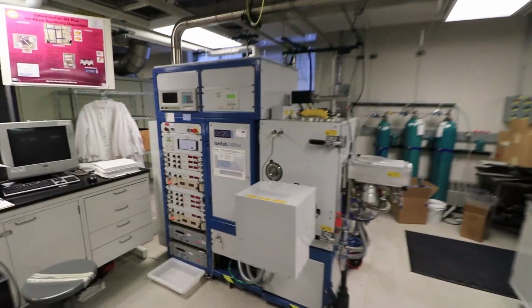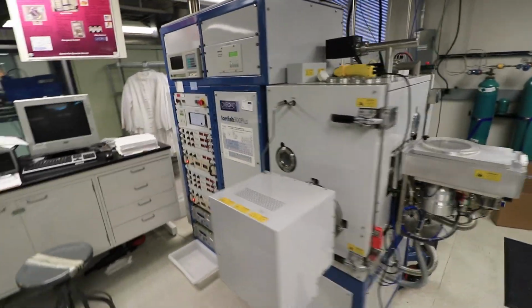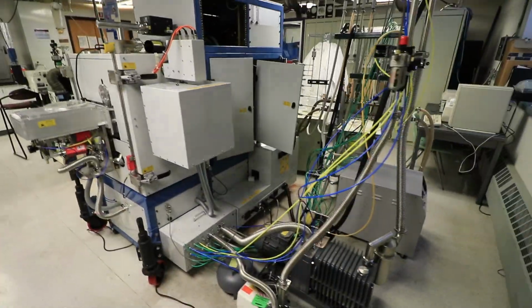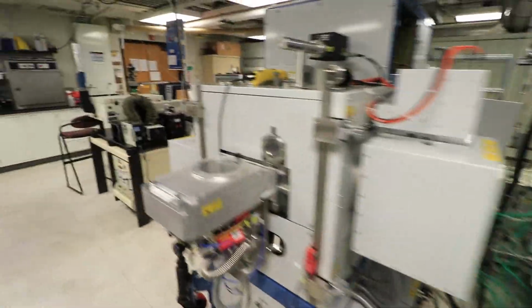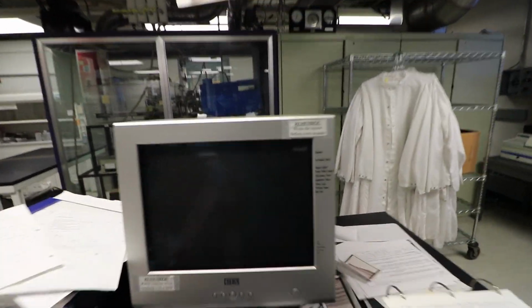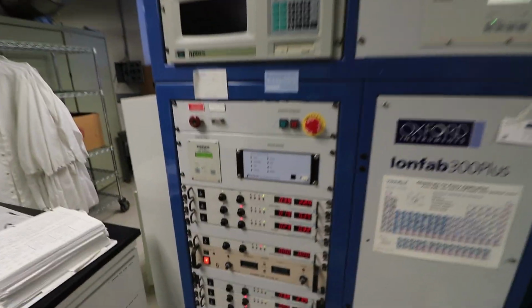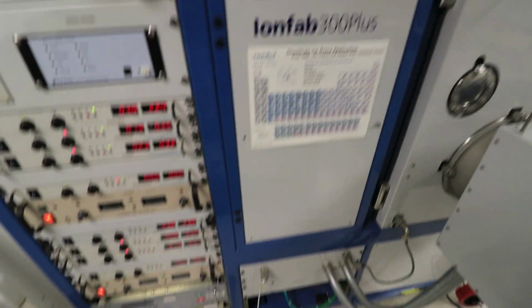This is an Oxford Instruments dual beam ion beam deposition system that's used to deposit various optical thin films. The system has a turret for the deposition of multiple composition stacks, as well as a secondary ion beam that is directed at the wafer that allows for the deposition with very high plasma temperatures at the surface, but wafer temperatures near room temperature. A gas mixing cabinet allows for gas injection to attain more stoichiometric films.